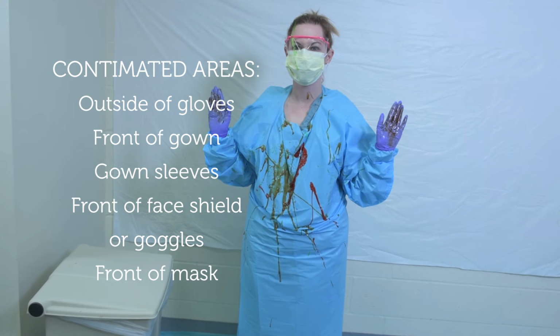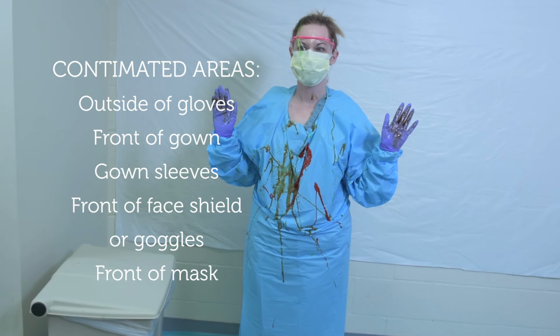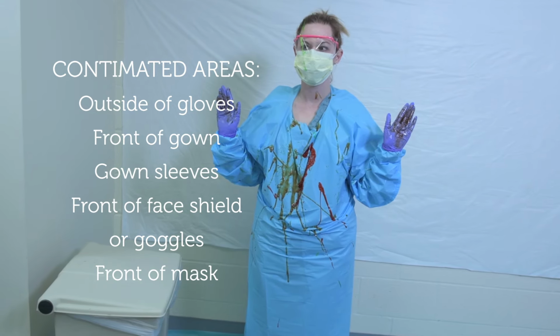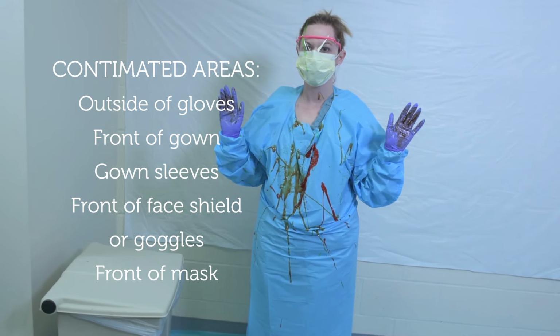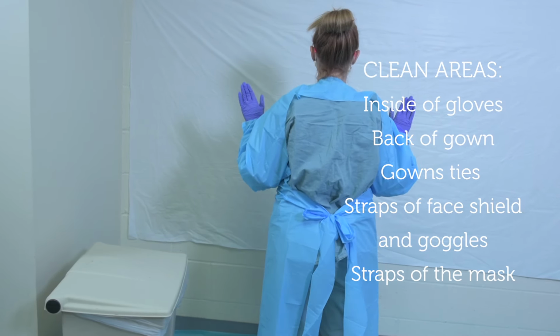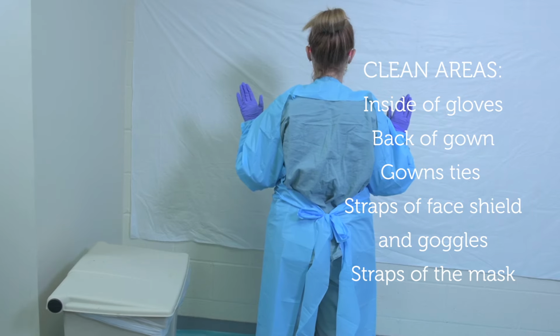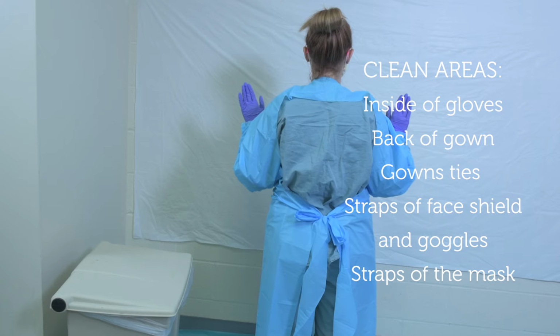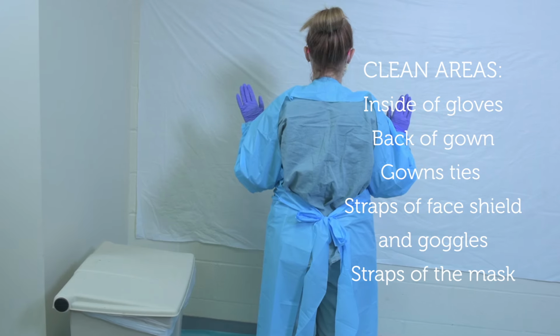Contaminated areas include outside of gloves, front of the gown, gown sleeves, front of face shield or goggles, and the front of the mask. Clean areas are often inside of gloves, back of the gown, gown's ties, straps of face shield and goggles, and the straps of the mask. This is why you don't tie the gown in front of your body.